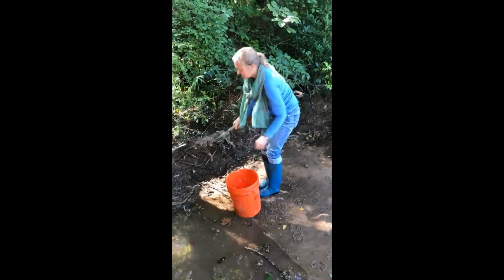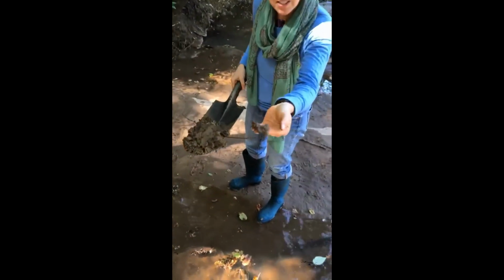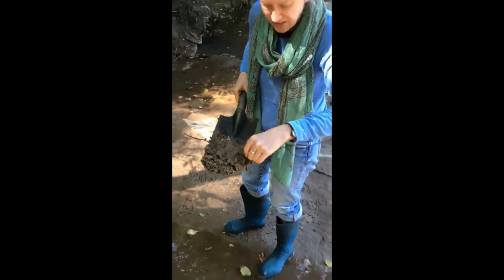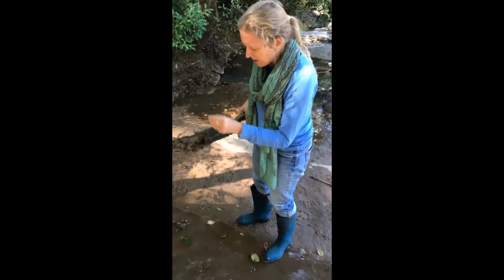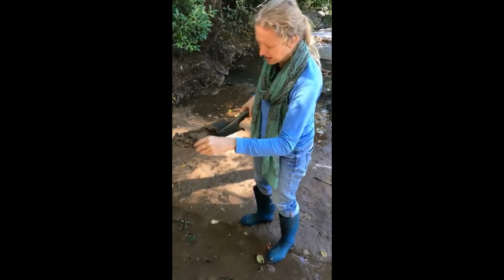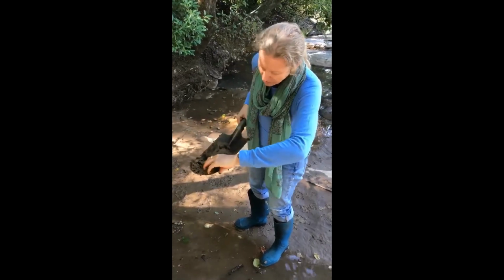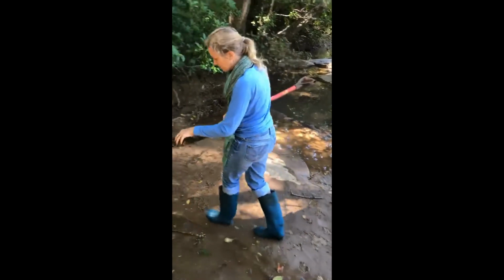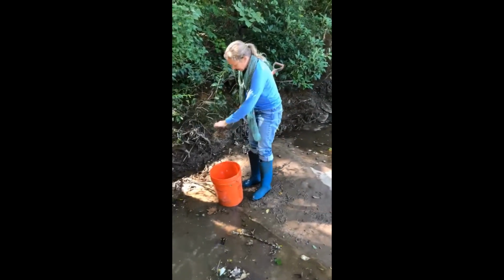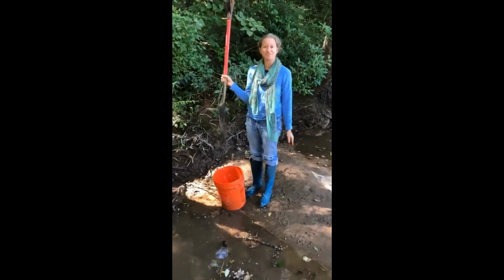And just to get a sense of the texture here, you can see it's got a good deal of clay and sand. It's got that earthy smell, but there's also just a wee bit of a sulfur smell. Might as well pull out some of these roots, organic matter. We're not going to want that for our experiment. This is probably more recent deposition of the sand, but we're going to go for this more clayey mud for the soil. So that's our location of the soil.